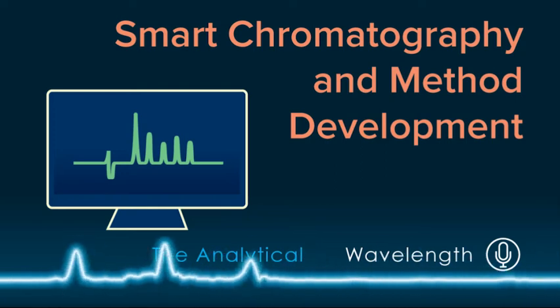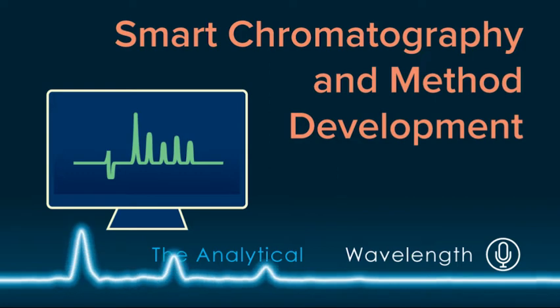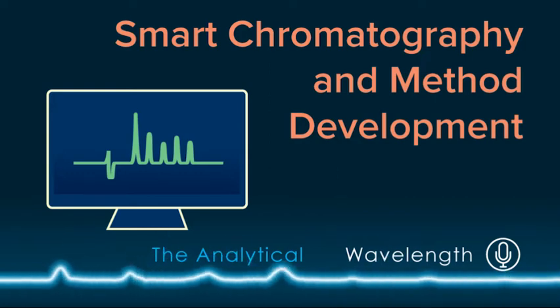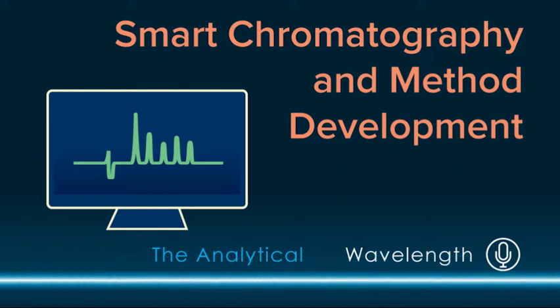It allows the opportunity for you to democratize chromatography method development. You don't need to have a PhD in chromatography or have done it for 25 years to develop completely adequate and acceptable methods. But that's a double-edged sword. By democratizing that, anybody can do it, but what happens when it falls over?